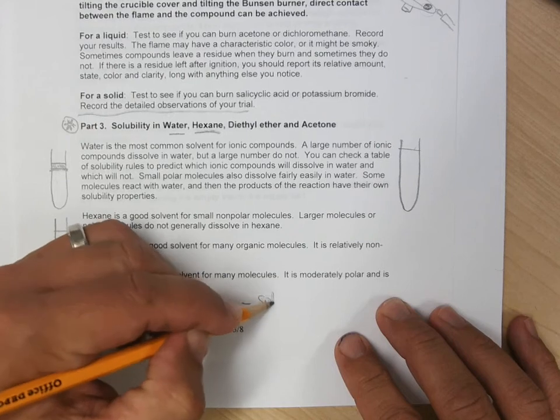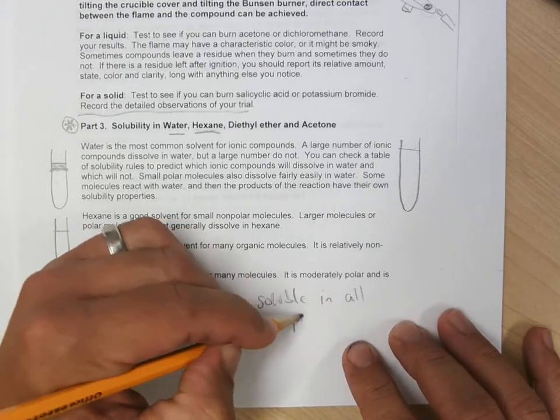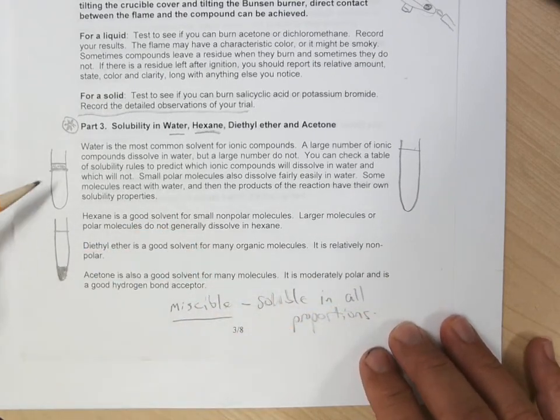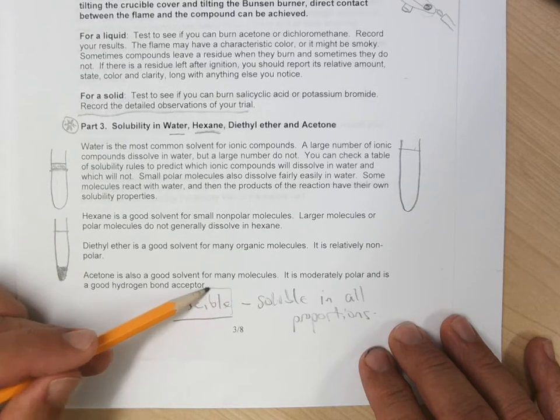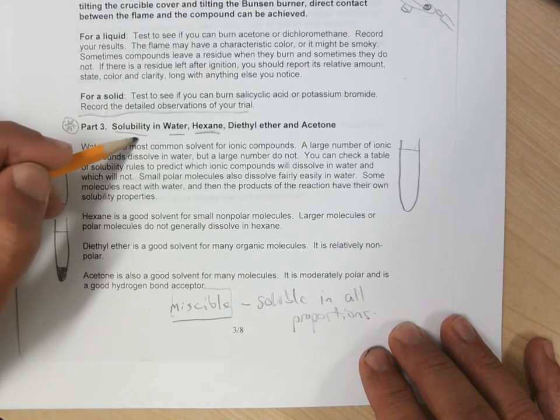Miscible means soluble in all proportions. So if you could throw a few drops in and they dissolve, that would be soluble to a certain extent. If you threw a few more drops in, they might not dissolve unless it's miscible, and then it'd be soluble in all proportions. So in this lab, we're testing for solubility.